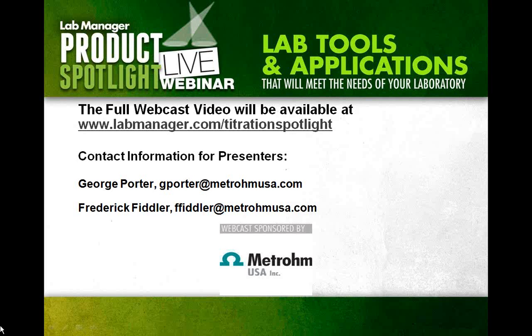Okay. And is the Tiamo software manual available online? That was the other question. Yeah, if you go to www.metrohm.com, that's not Metrohm USA, but metrohm.com, there's a full support section for the Tiamo software that does have a PDF of the manual available.